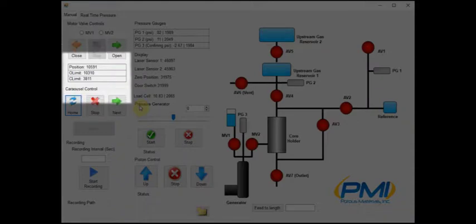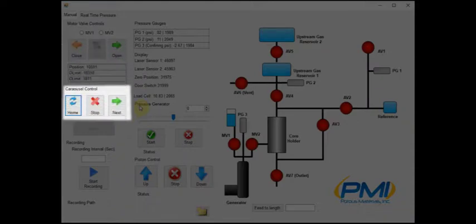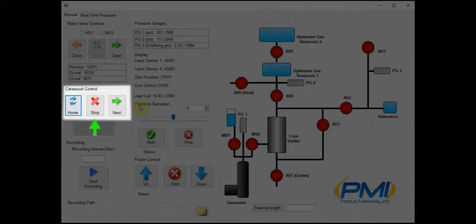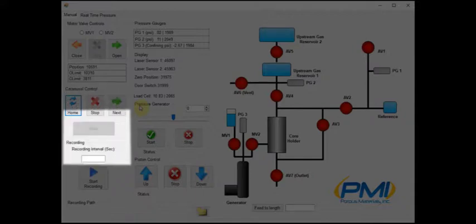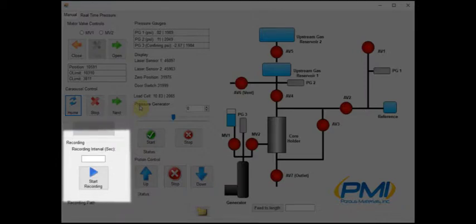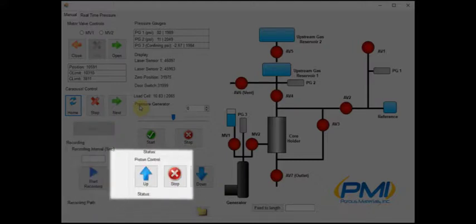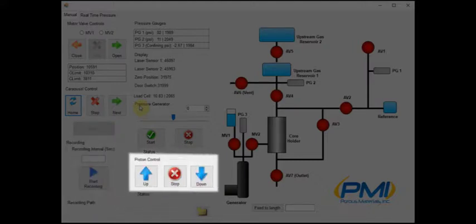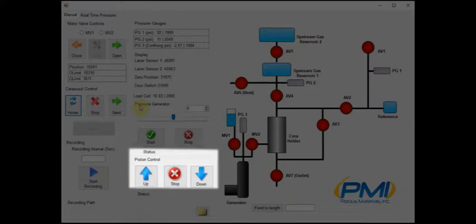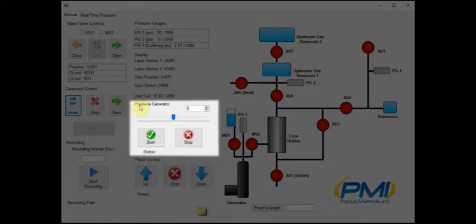Below this section we will find the carousel control. This allows us to return the carousel to the home position, stop, and move to the next position. The recording section gives the user the ability to sample data at predetermined intervals and save it to a specified folder determined in the field underneath. We also have the ability to control the piston's movement up and down as well as the pressure generator.